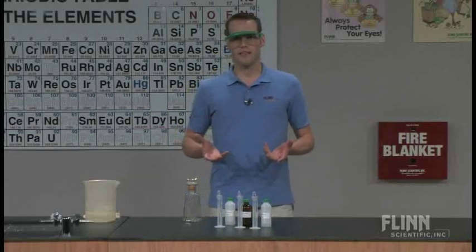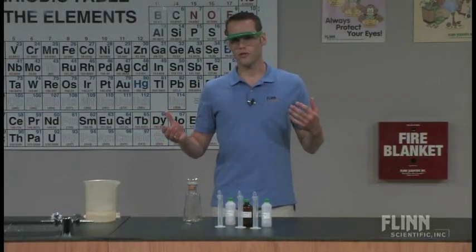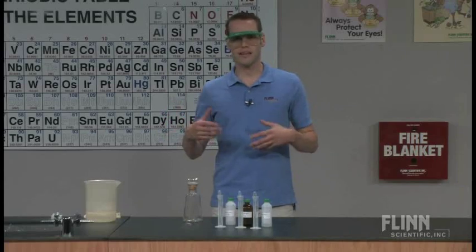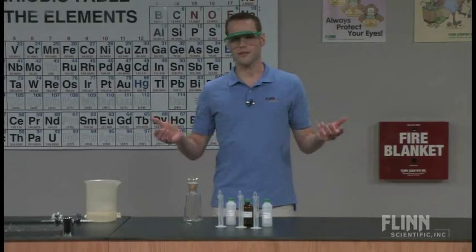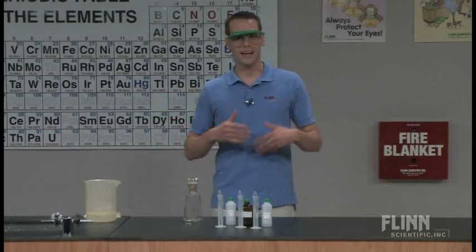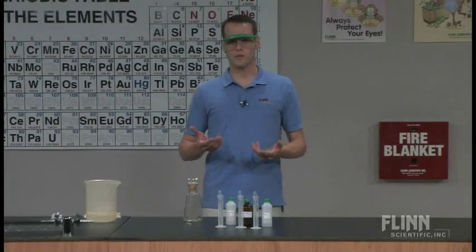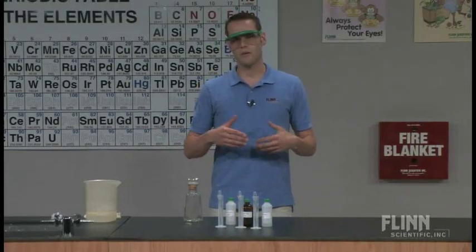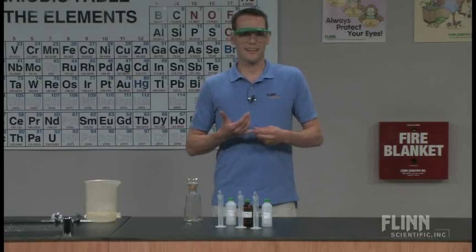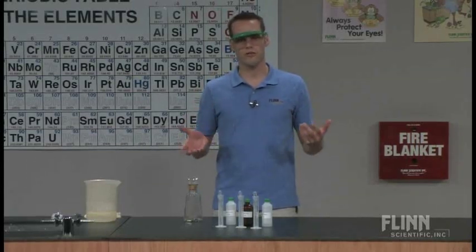I let them bring in any glass bottle they want to. I have a huge stockpile of twelve fluid ounce glass soft drink bottles that a student of mine brought in. If a student forgets one, I have a reserve for them to work on. You can also do this with clean unused laboratory glassware, but I find when they bring in their own bottle they find it more interesting, more creative and we have a lot more variations.